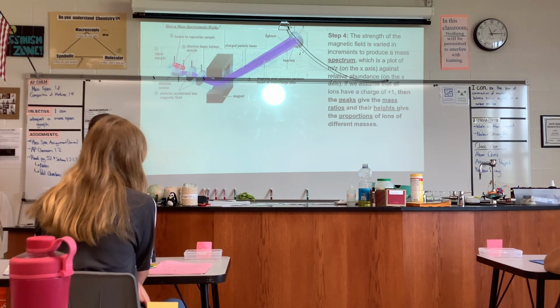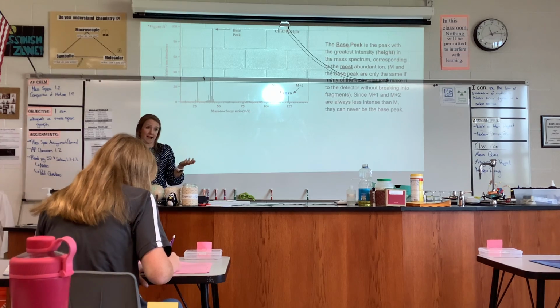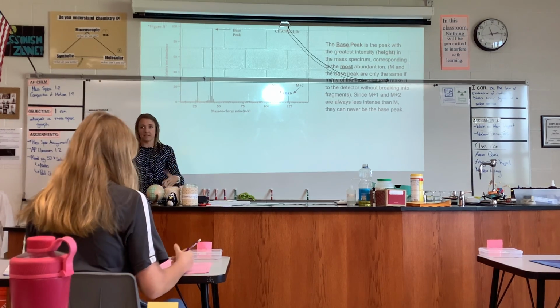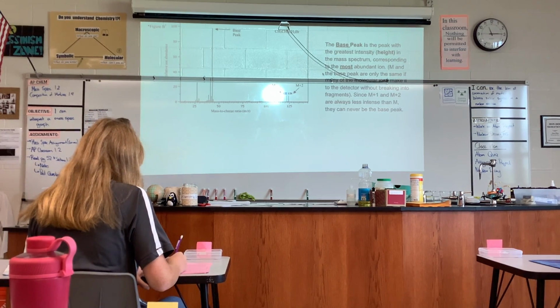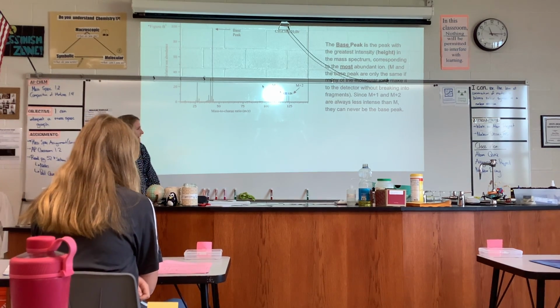Let's take a look at a graph. So this is an example of what a mass spec graph looks like once you are done analyzing and the data that comes out. So they're a type of bar graph, they're just really narrow looking often.